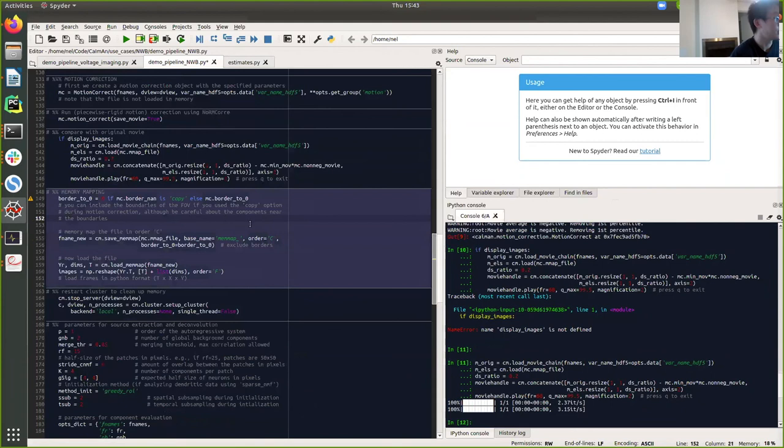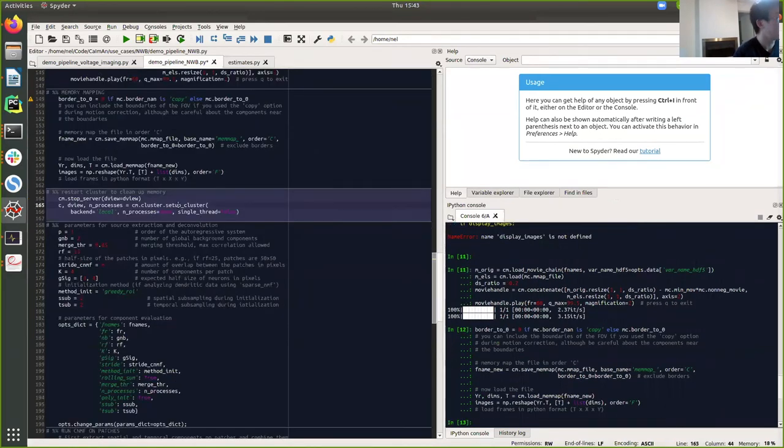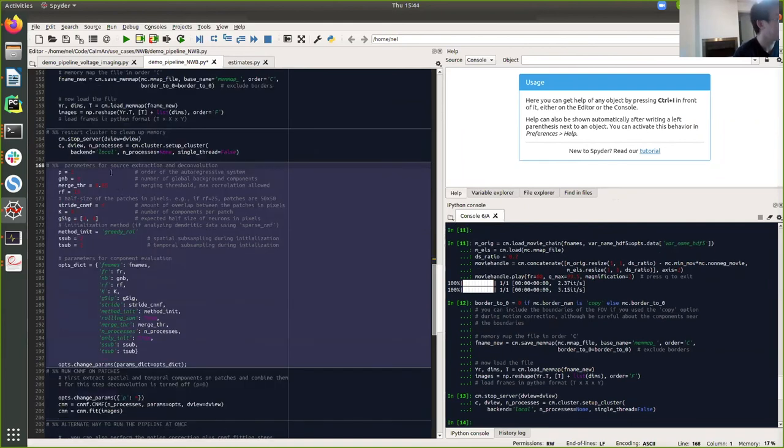So one parameter, this parameter needs to be noticed. That's whether you use piecewise rigid motion correction or you just use the naive rigid motion correction. To motion correct this video, we use the piecewise rigid. So after motion correction, we save the movie into memory mapping format. Here we save it into the C format. So this step should be quick. And we restart the cluster to clean up the memory.